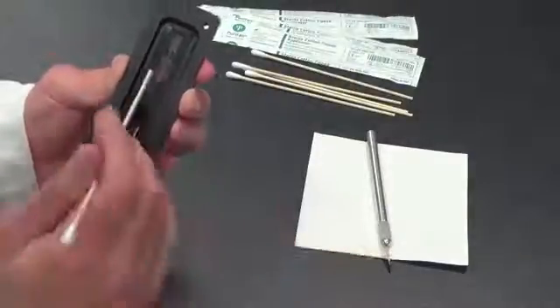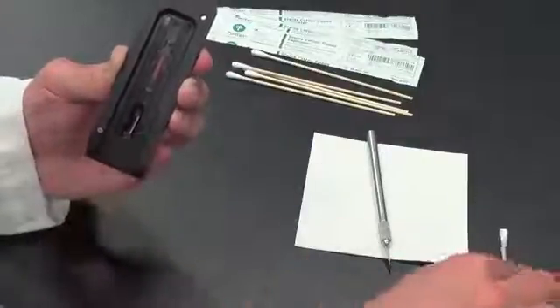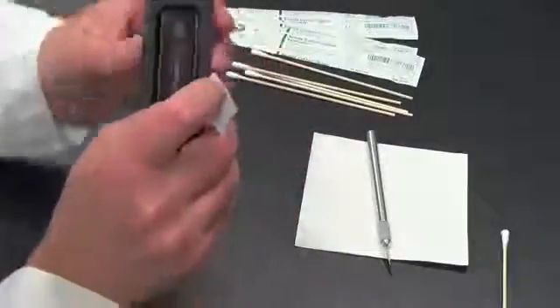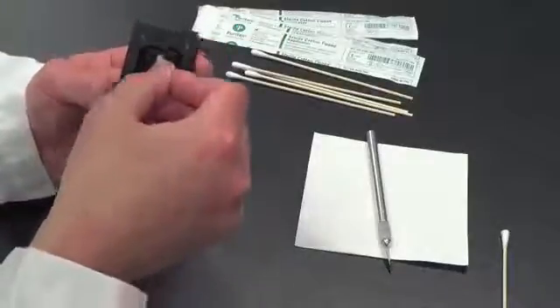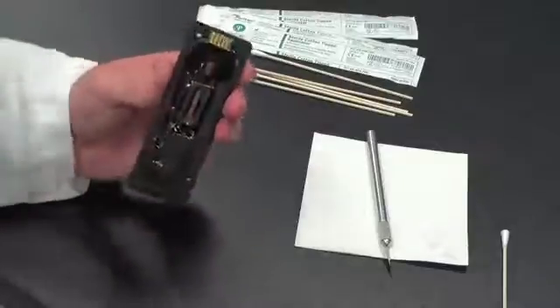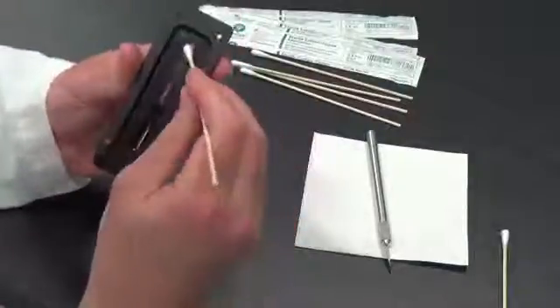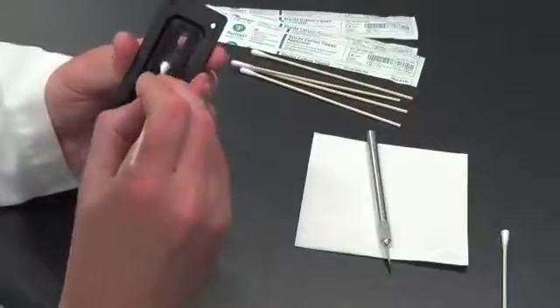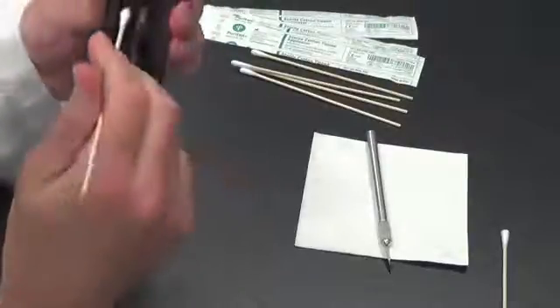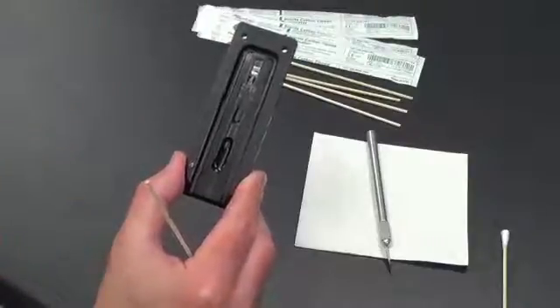And if you see any fingerprints or any other dirt from your hands as you're replacing the lens, take another one of those alcohol wipes and clean that window lens area completely. What we want to do is make sure this lens is very clean and there's no residues from fingers or anything else from the replacement process. Again, make sure there's no wet alcohol remaining on the slide once you clean it. So using a cotton swab, dry off any last remaining alcohol residue from the slide. You can hold it up in front of a light and make sure that there's no remaining dirt or debris on that slide. Once complete, what we will do is reassemble the whole device.